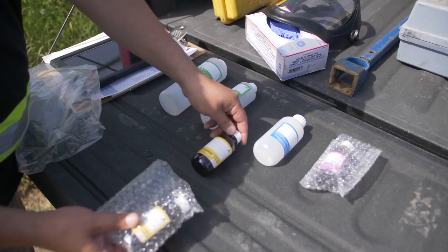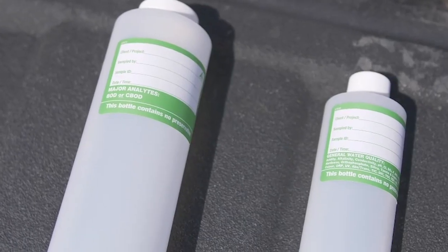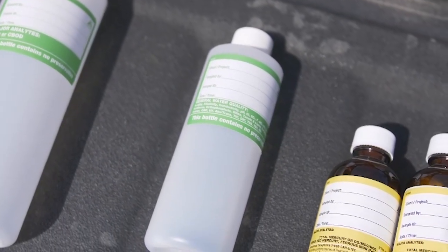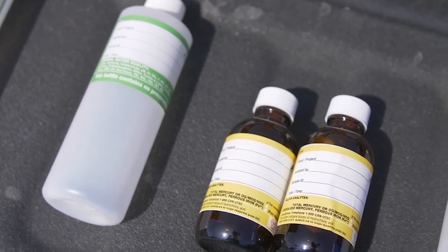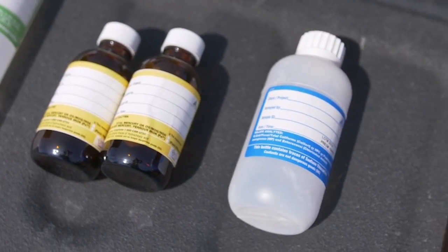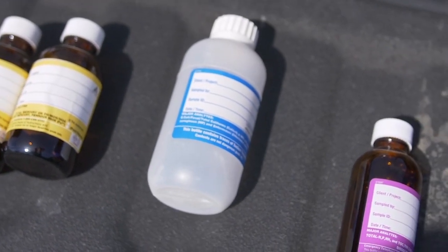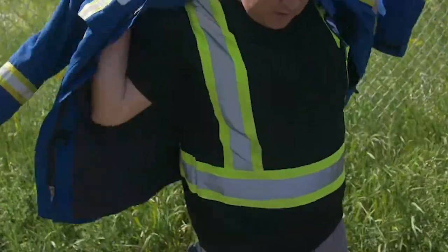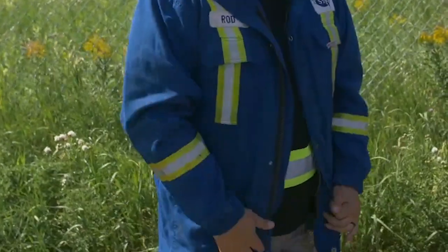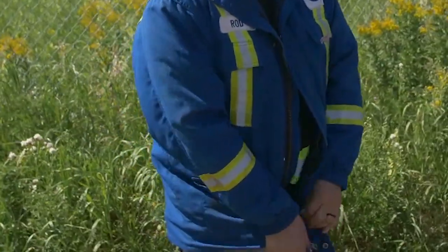You could take half an hour to an hour before doing the samples to fill out the proper information on each bottle, because I've done it where I would sample and then leave the site, then remember I had to do it before I dropped them off at the lab. So I had to re-suit up with the PPE, take them out, dry them, and use a waterproof marker — you can imagine how unpleasant that could be handling them after you've filled up each sample.